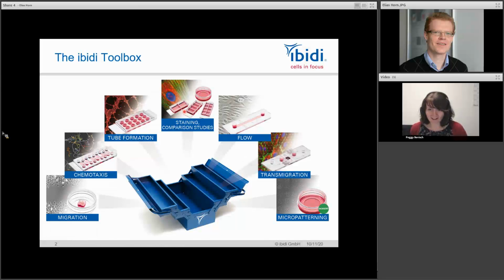Then Julia Thorne asked what tool we used to track the single cells for the chemotaxis assay, and Magda already knew, but only half. That was half true, Magda. We have an ImageJ plugin where you can manually track those cells when you do chemotaxis assays. So you go from image to image to follow 40 to 100 cells, which takes a lot of time. The movie that you saw was done with Fast Track AI.